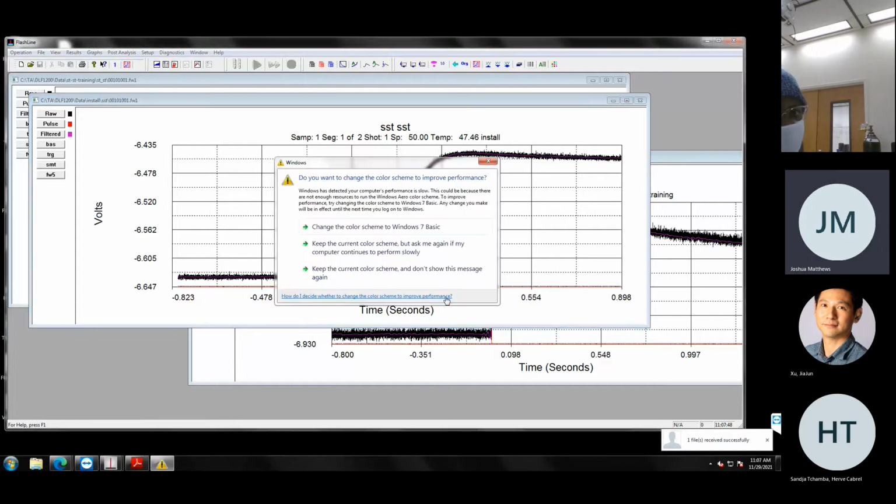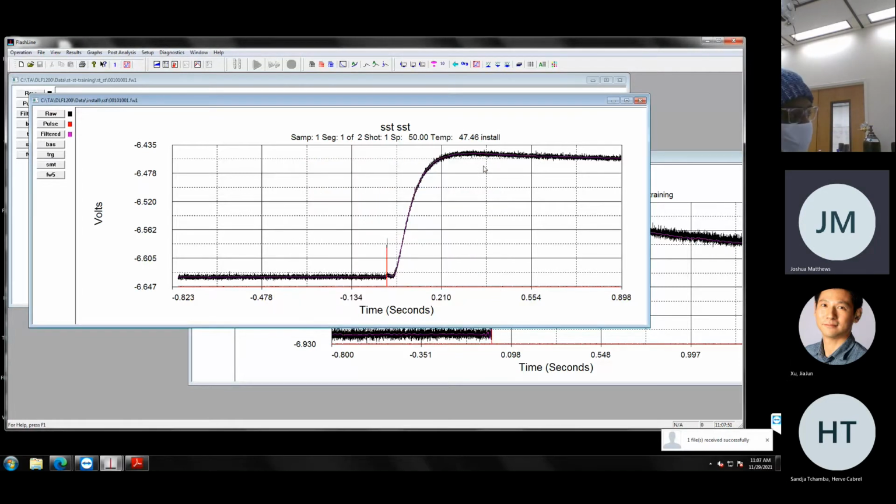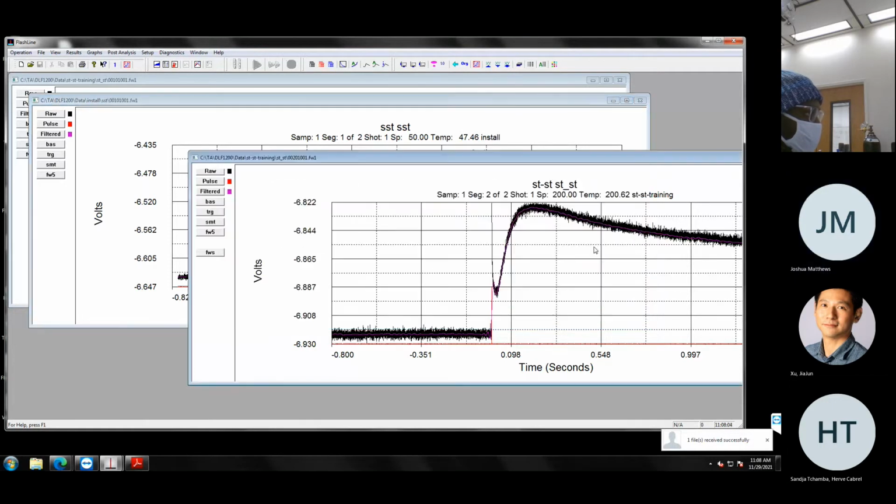So remember, one of the key things for the diffusivity formula is the half peak time, or the peak half time. So here's our peak, right? The diffusivity formula takes the time it takes for the baseline to get to its peak, and takes half of that. If the baseline starts way over here, the number that you get out of that is not very good.